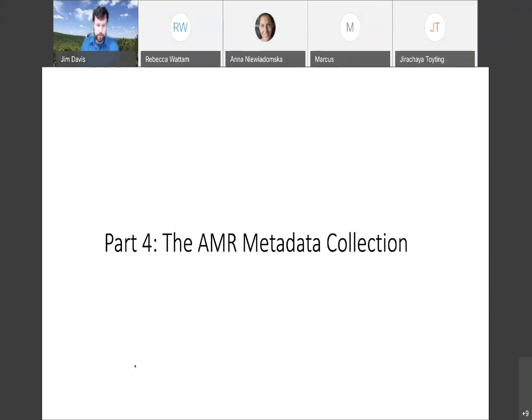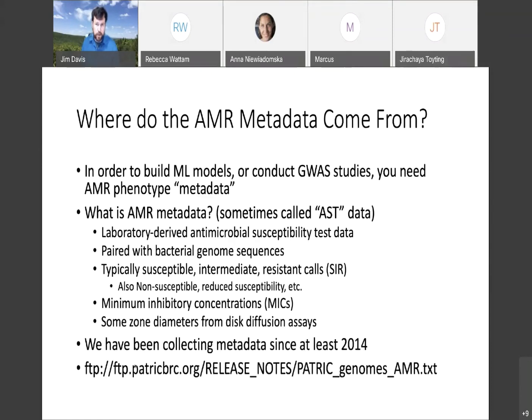So this brings me to the fourth and last part of the webinar, which is the antimicrobial resistance metadata collection. At PATRIC, we have been collecting antimicrobial resistance metadata for a really long time.